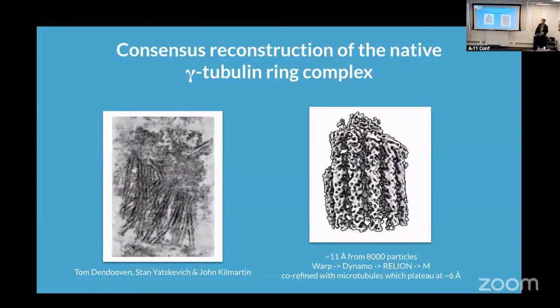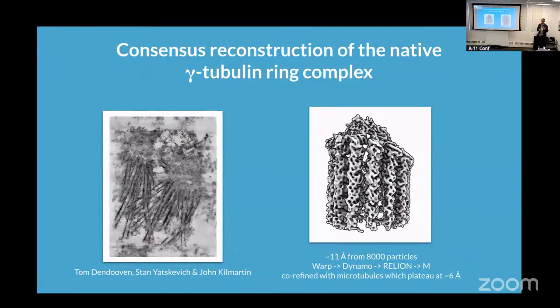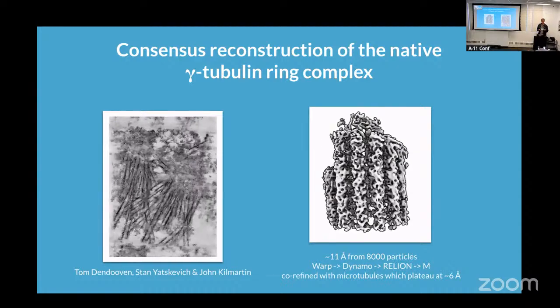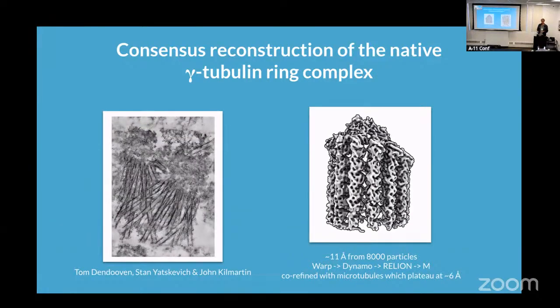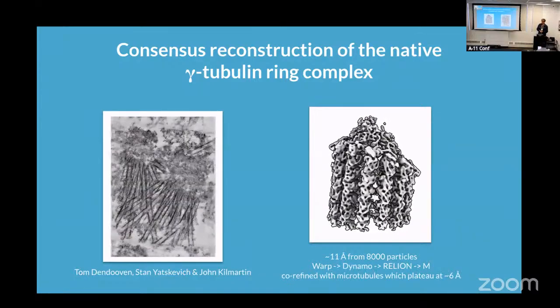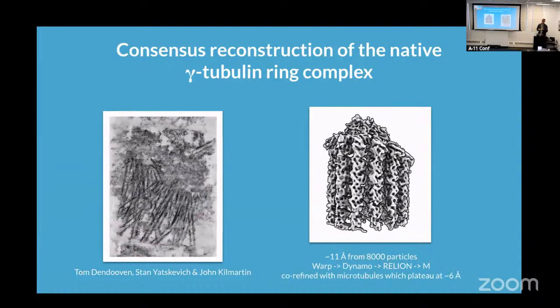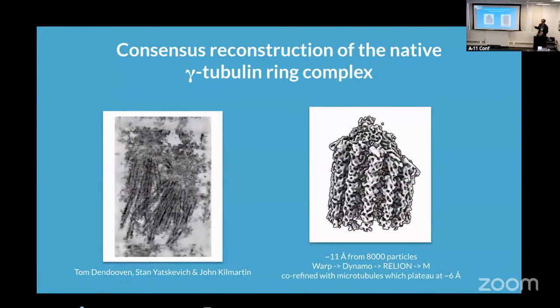It's a big complex piece of biology, and worth making a quick aside. Often the way that you make a project tomography amenable is by figuring out a way of getting your throughput high enough that you can really collect enough tilt series or tomograms to make it work. So we know that lamella milling is, for the most part, very low throughput. Maybe lamellae of a rare event is not going to be what works for you. Maybe you need to find a way of increasing the likelihood of seeing your target when you mill or seeing your target when you get to the stage of imaging.